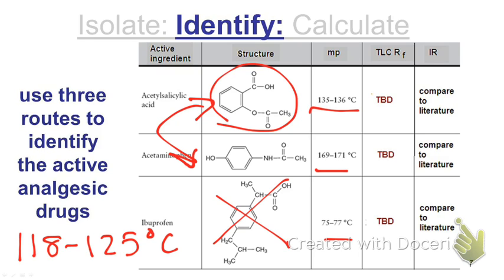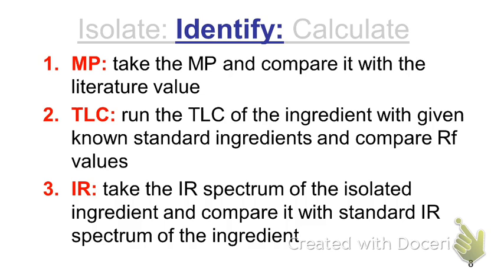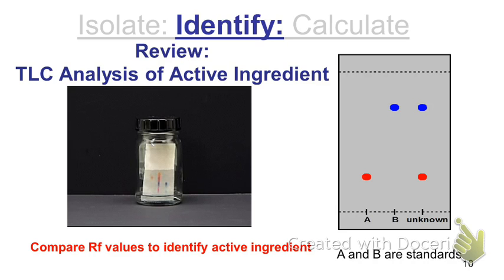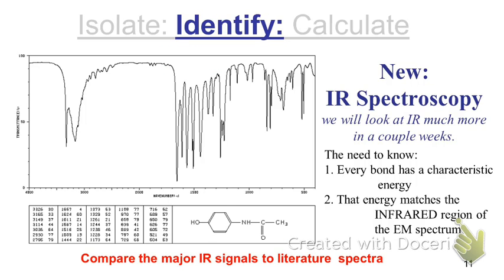Okay? The very last technique is IR, and it is the most sketchy as far as our equipment goes. Okay? Which we'll talk about in just a second. So again, all of the individual parts. Okay? You've seen melting point. You should in theory know how to do that. You got all those lovely pictures. TLC, again, in theory, you should know how to do that. And then IR. So this is our new portion of this.